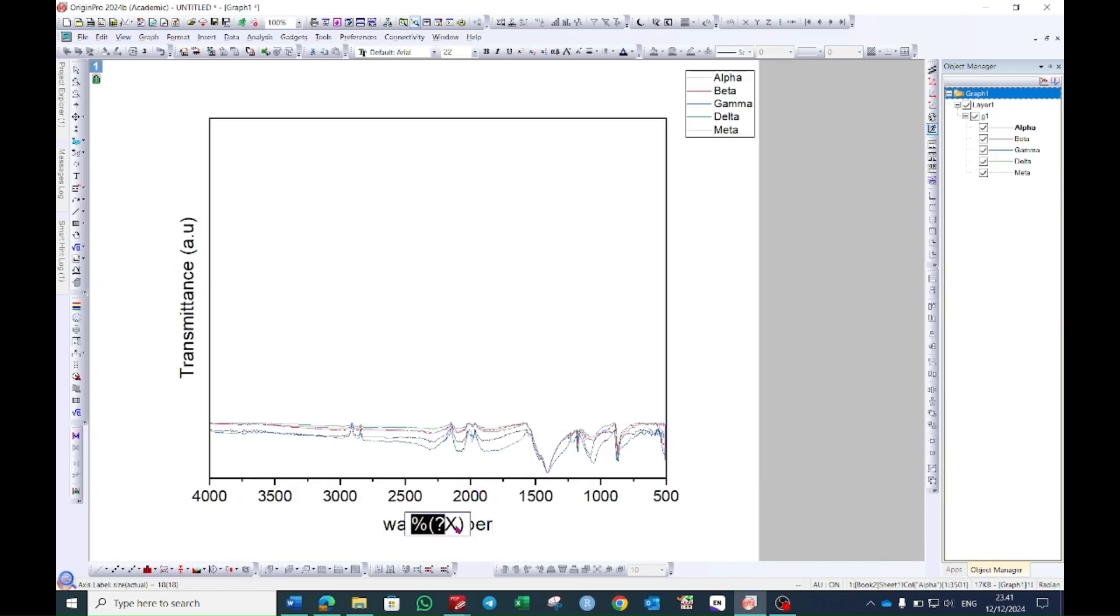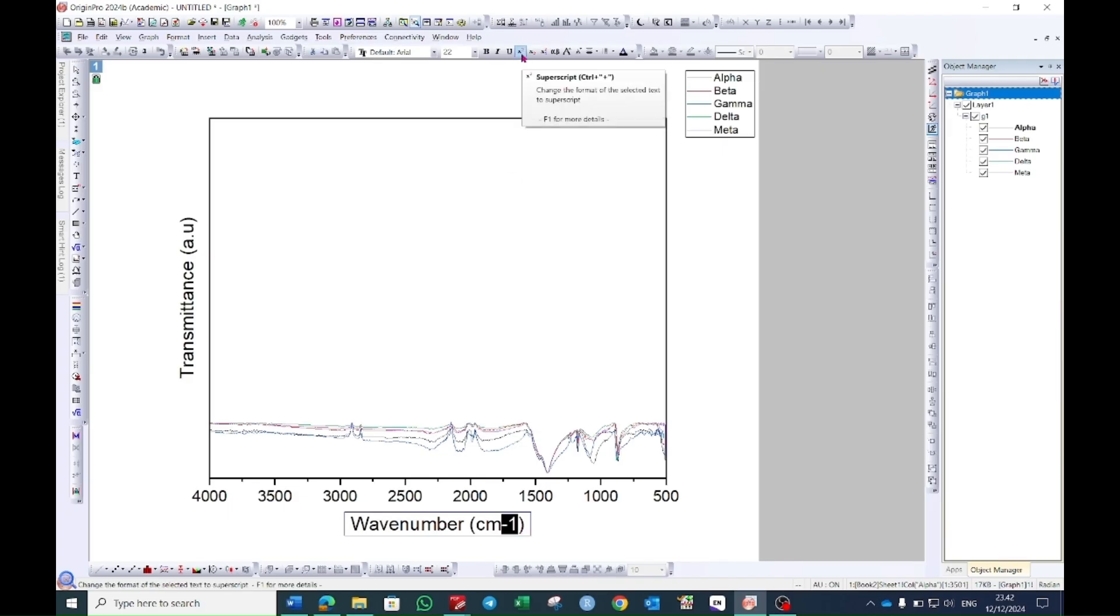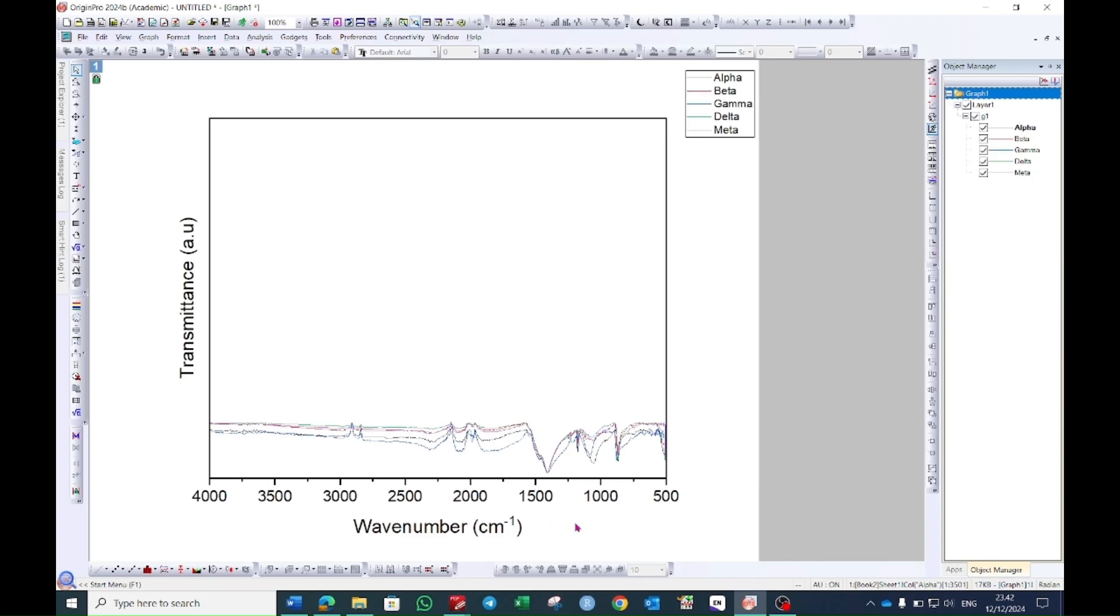Double select the y-axis and make it as wave number and then give the unit which is centimeter minus one. Now select this minus one and in this tab you will see here which is superscript. Select this one and it will make it as superscript.